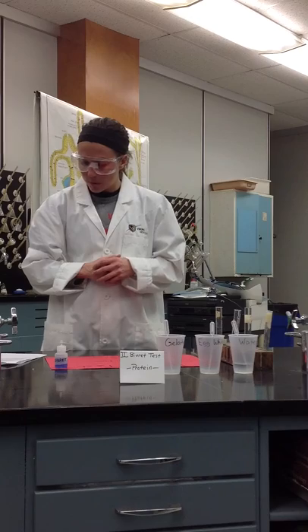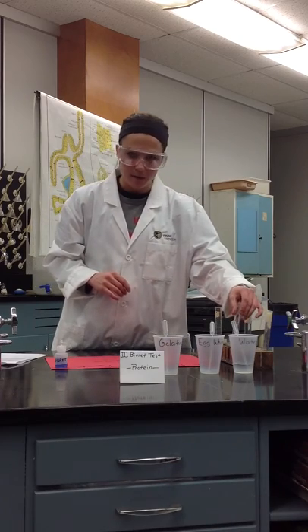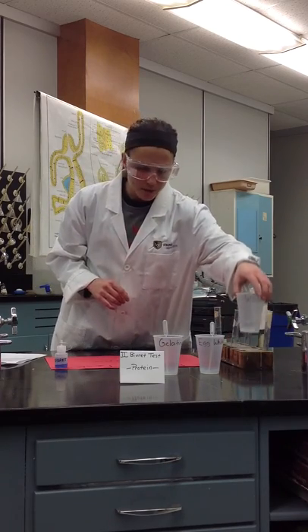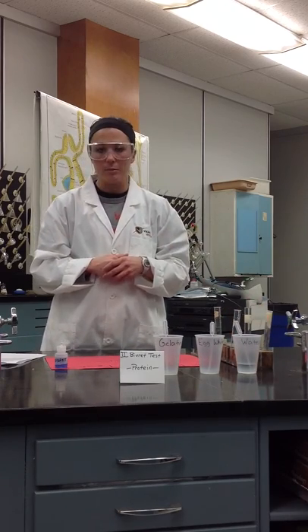To test tube number 2, you're going to add a dropper full of gelatin. That can be found here. And then to test tube number 3, again, you're going to add water, which will act as our control. Water is found here. Test tube number 4 obviously is not going to be used.